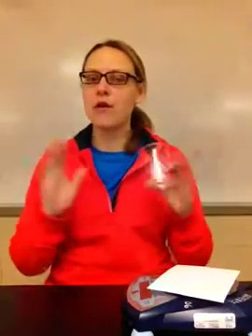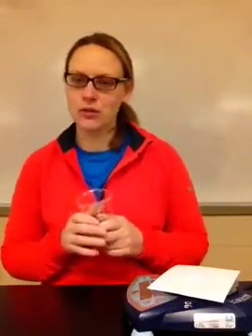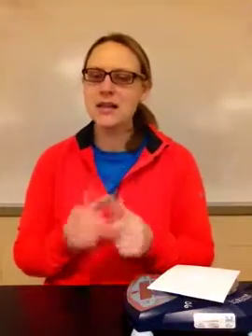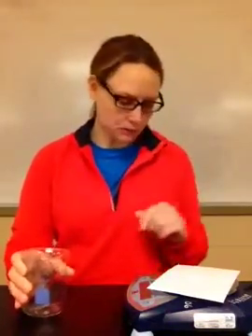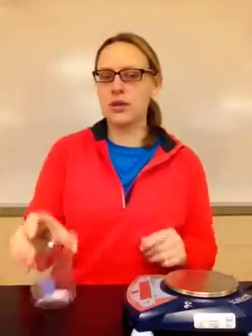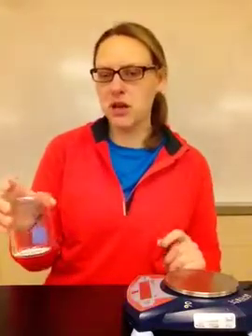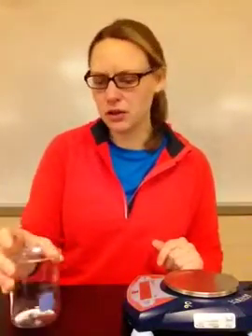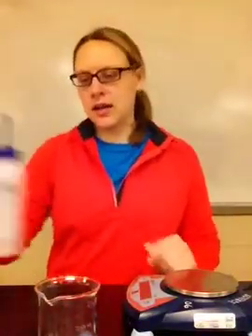You are going to have full range of whatever glassware you want to use, things like that. You just have to document everything that you use. You're going to want to state what size it is, how many you have of them. Okay, so I mass out my first substance. Okay, and I'm going to put it into, I'm choosing a beaker. This is actually a 250 milliliter beaker. It doesn't really matter the size. Maybe it does. It's up to you what you want to do. Try it out. Okay, so I'm going to put the first white solid in there.